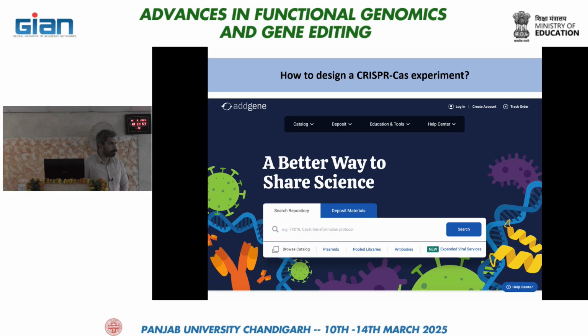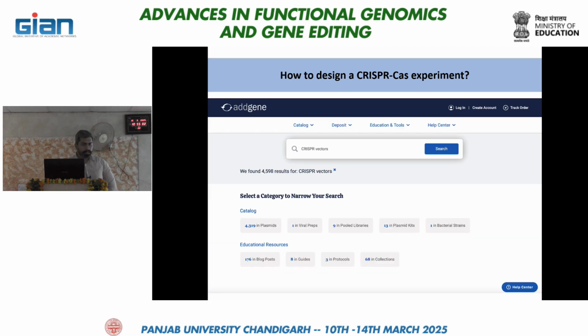Please let me know if you have reached the home page. Okay. So here in the search bar, you can just type CRISPR vectors or CRISPR and then search it. With this search, it will give you some results. In this case, if you type CRISPR vectors, you can get a list of 4,319 available plasmids in this repository.